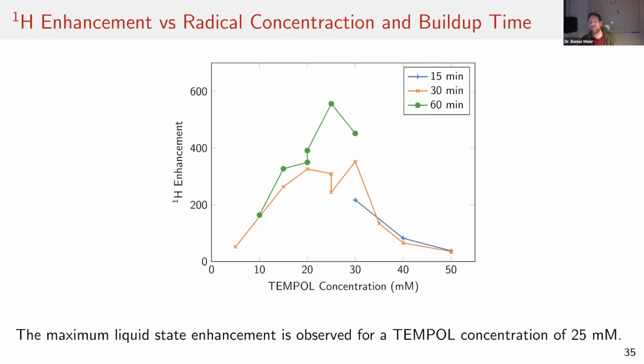And I think moreover, if you have protons like these fast relaxing on the molecules, then we see the relaxation due to the radical, but it's not the absolute dominant thing. So even if we reduce the radical concentration, we see a modest reduction in relaxation rates, let's say. But it's not the primary thing that we feel we need to work on. But of course, there are interesting ways to deal with that problem.